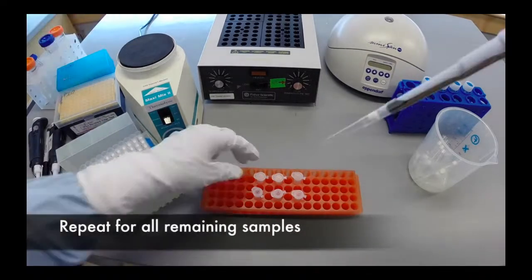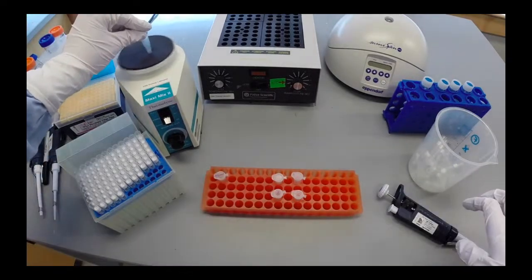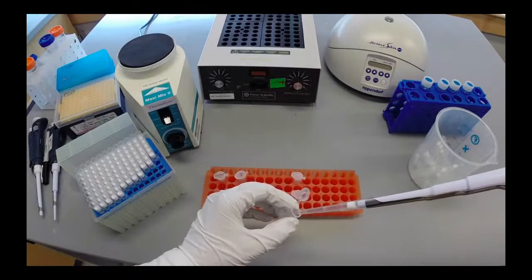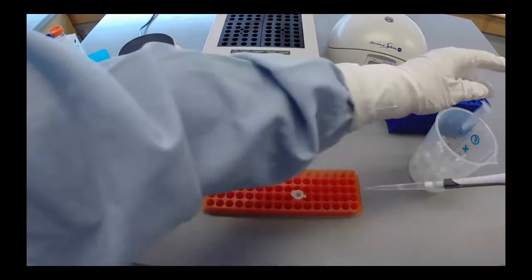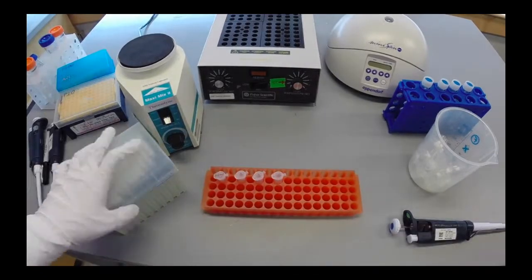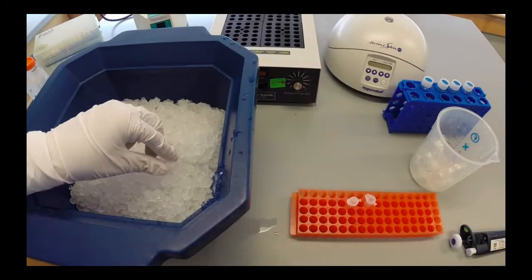Repeat this process for all remaining samples. Embed all samples in ice for 10 minutes.